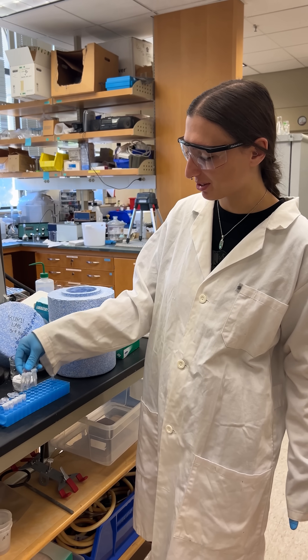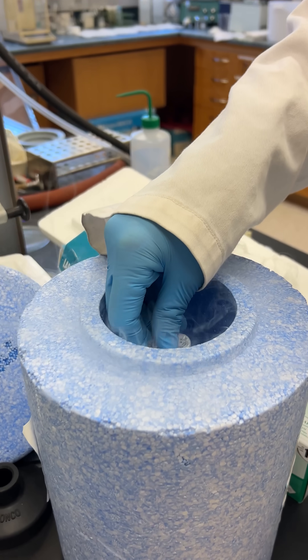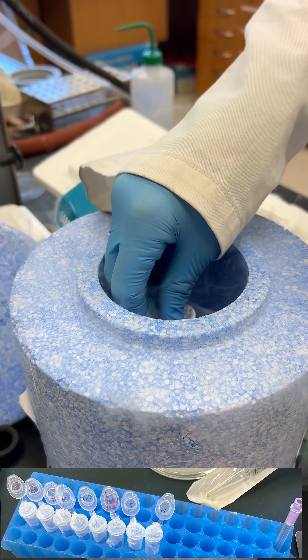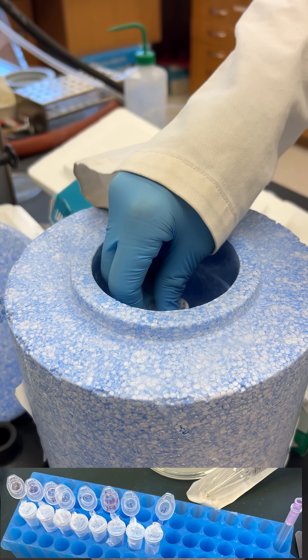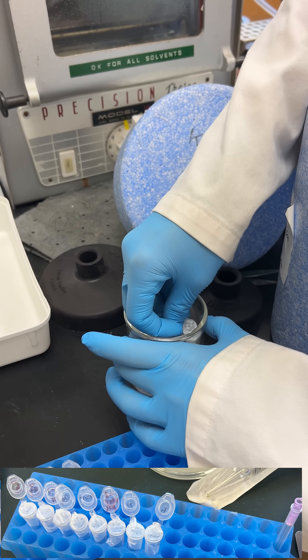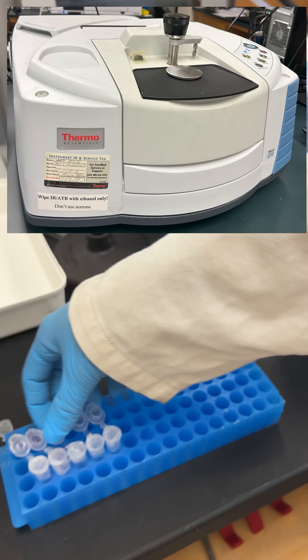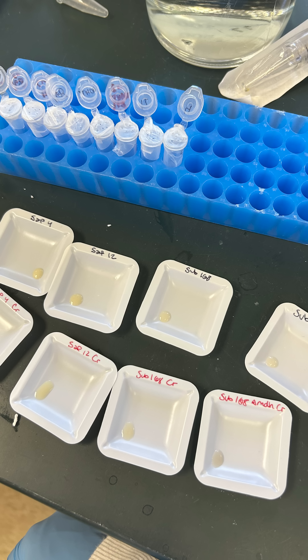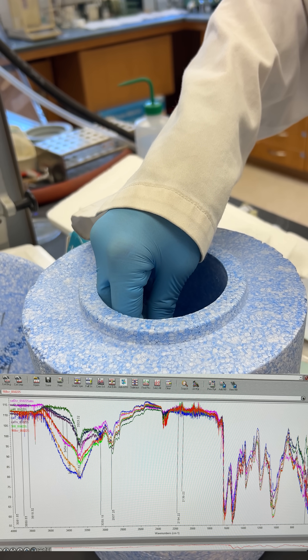Okay Haley, what are you doing? I am going to lyophilize these samples and hold them in the liquid nitrogen. We want to test different methods for the IR. We're doing one where we dry our samples manually — they're air drying right now — and then we're doing another method where we're lyophilizing the samples to see if we get different peaks and different signals on the IR.